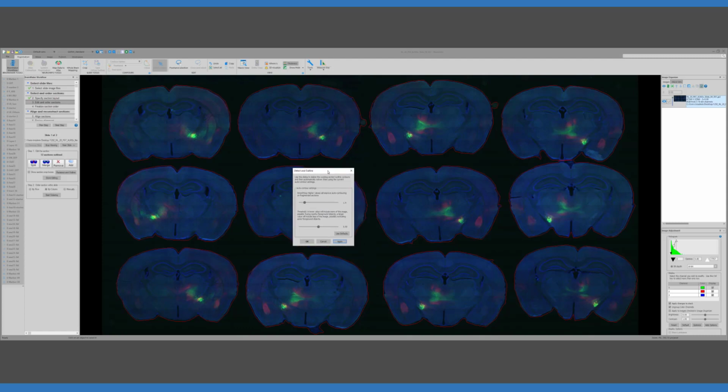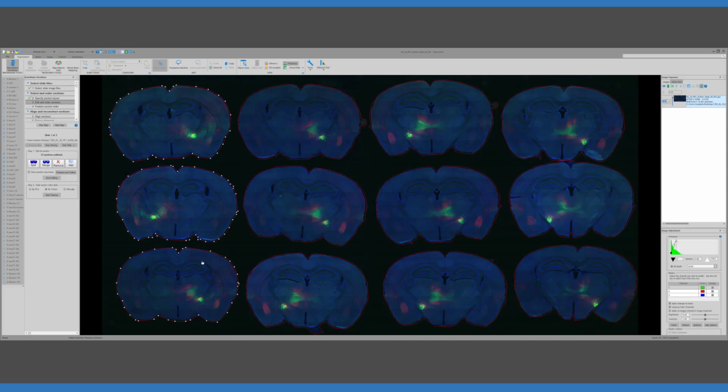And the next thing, for the purposes again of demonstration, I'm going to delete some of these that have been detected. Going to remove these, delete the selected content. So now there's 7 sections from this slide that have been detected.